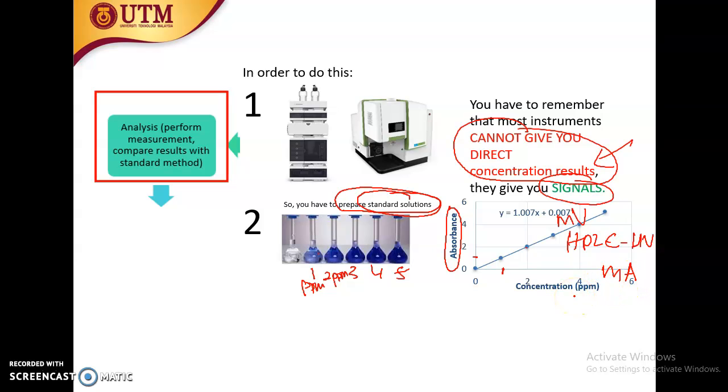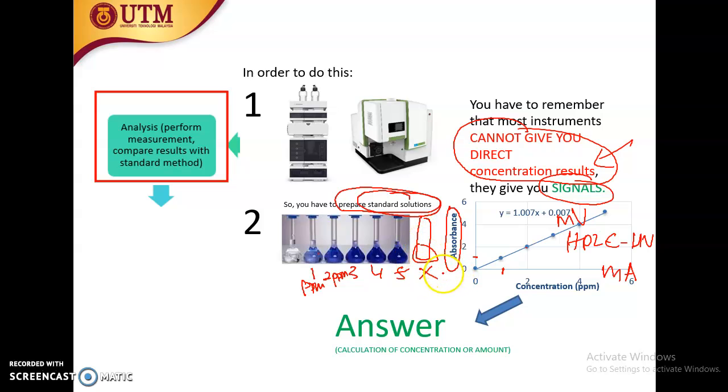Okay, so where is the sample? Okay, the sample is that when you run another volumetric flask, another volumetric flask labeled as X, you know is zinc inside, for example. Okay, you run, and then the sample will give you, for example, reading of absorbance 3, for example, or 2.5. Then you know, okay, at 2.5 the concentration is 2.5 ppm.